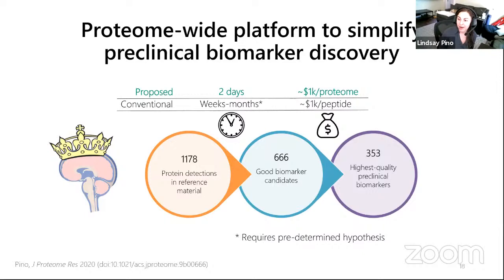Question from Ahmed, how did we determine the LOQs of peptides? That's in this paper, which we're not going to dig super into the details, but this J Proteome Research paper from last year goes over the methodology for building the actual samples for calibration curves. And then it also has a link to the data analysis to calculate LOQs from your data. You can also calculate LOQs using MSstats. I'm not sure if you're going to learn that later this week, but once you learn how to use MSstats, it's very easy to use this function in MSstats to calculate LOQs. I'll start at the top.